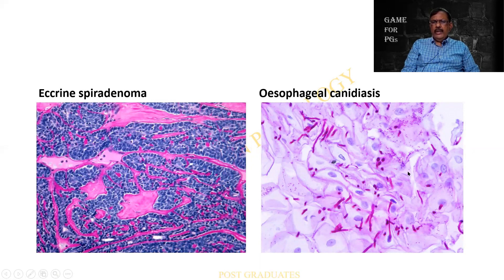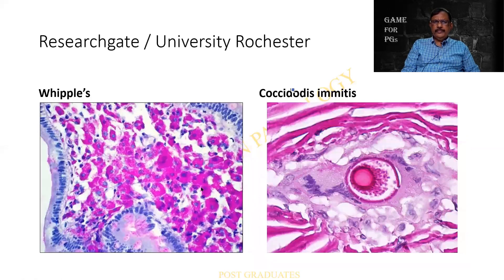Patients who are in immunosuppressive therapy, steroid therapy, etc. will be found to be positive. This is Whipple's disease — a malabsorption syndrome that we had been mentioning. Look at the macrophages — when stained with the PAS, they take up this magenta colour. A beautiful case of positivity.